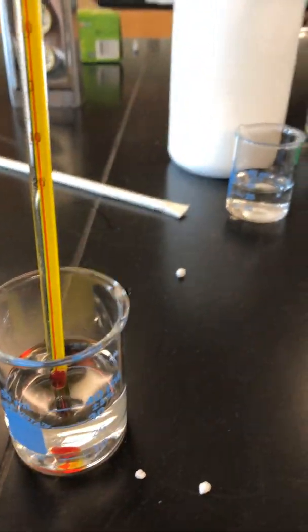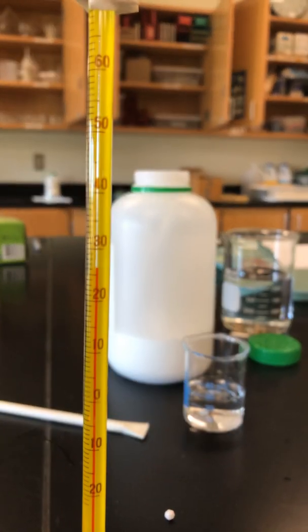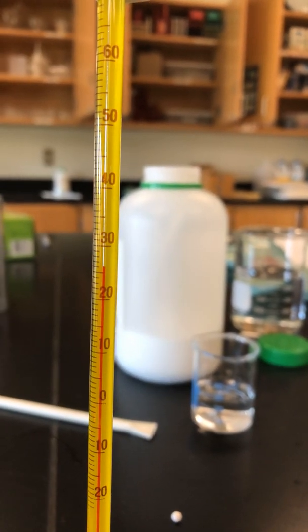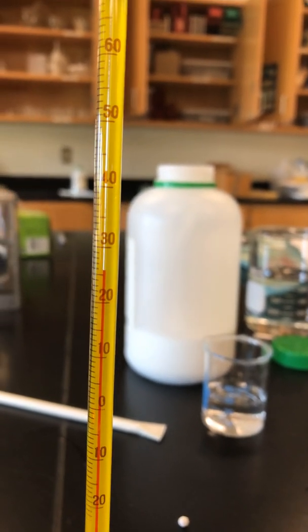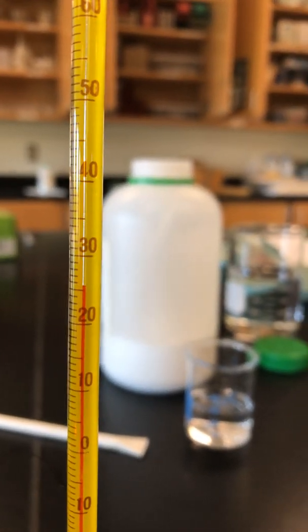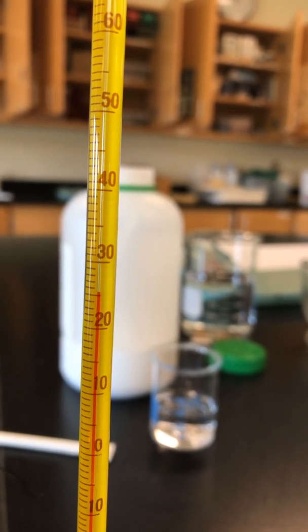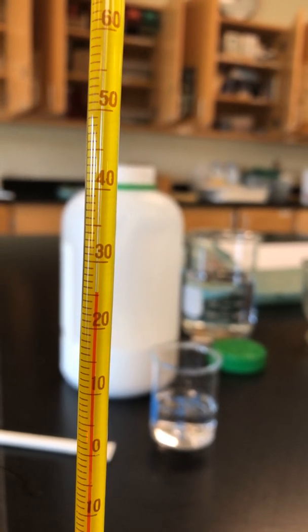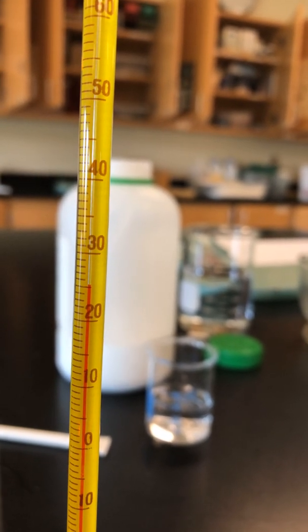Okay, so I have a fresh beaker of water. So this is for salt 2. So let's give the temperature a second to equilibrate so that we can record our initial temperature. Temperature has stopped changing, so record that temperature for the initial temperature of sample B, salt B.